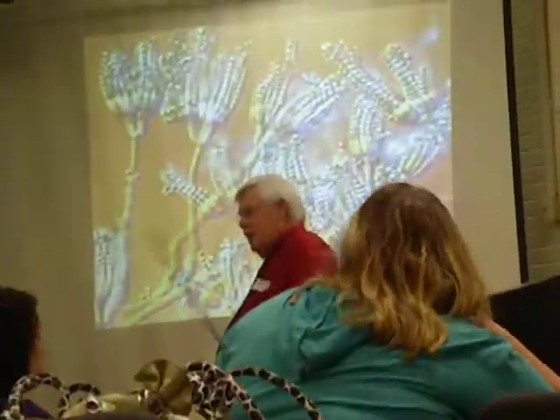Let's see what else I need to ask there. If you had to guess what species that would be? Penicillium.